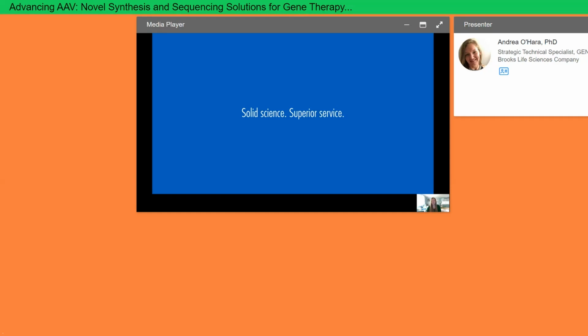Okay, and I see we have a number of questions, so I'm going to go ahead and read these off. The first question is, for recombinant AAV sequencing, how much single-stranded DNA do I need, or how many particles do I need? This is a great question.